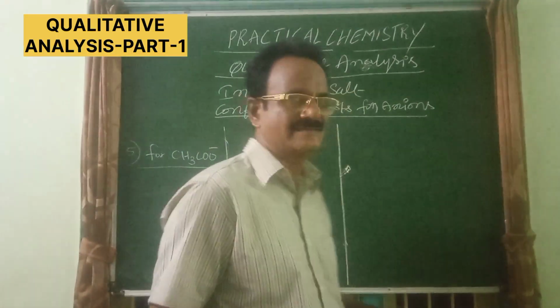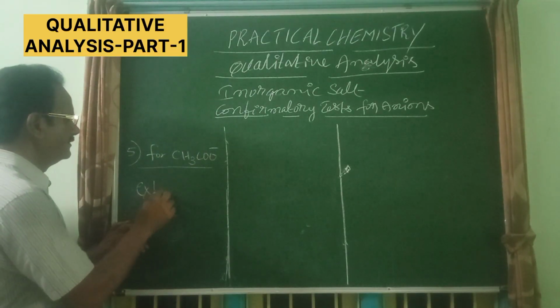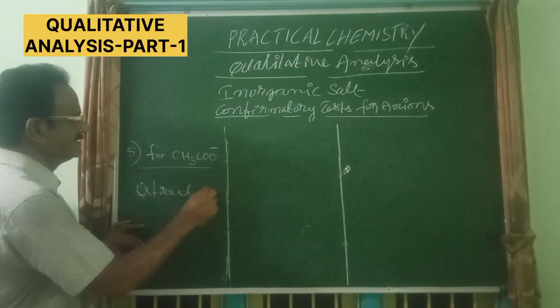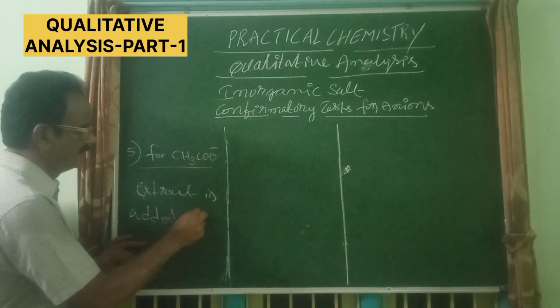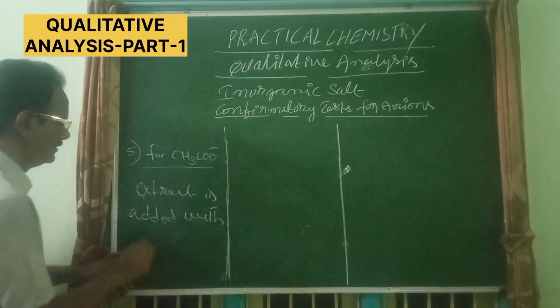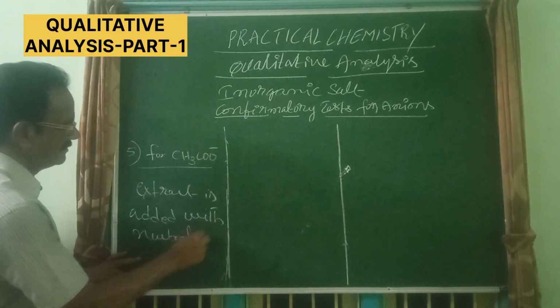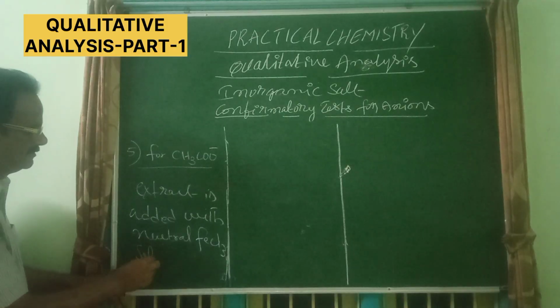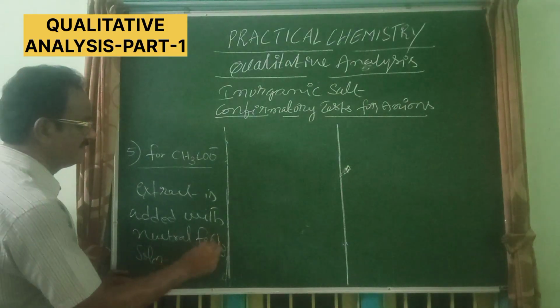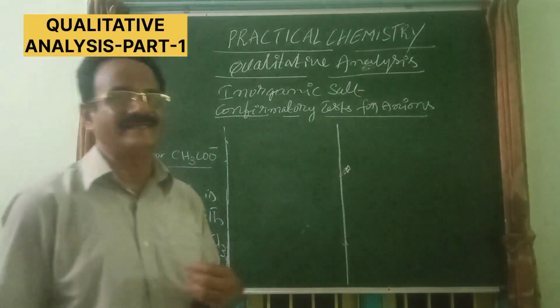Okay, see here, the extract is added with neutral FeCl3 solution, and then heated.